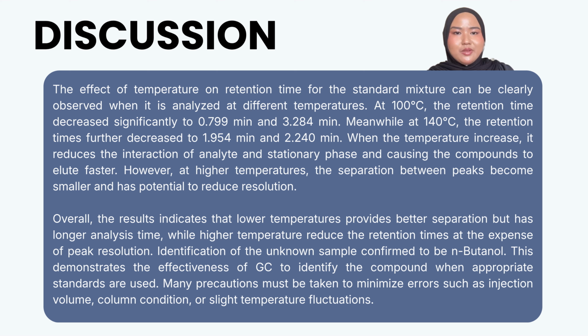Identification of the unknown sample was confirmed to be N-butanol. This demonstrates the effectiveness of GC to identify the compound when appropriate standards are used. Many precautions must be taken to minimize errors such as injection volume, column condition, and slight temperature fluctuation.